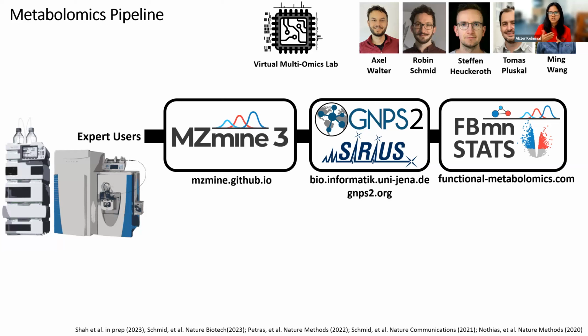And with Sirius, you could also further improve your annotations. And with this wealth of information from MZmine and GNPS, we wanted to also simplify it for the beginners in order to perform their downstream analysis and understand their data better. Therefore, we developed this simple web app, FBMN-STATS.